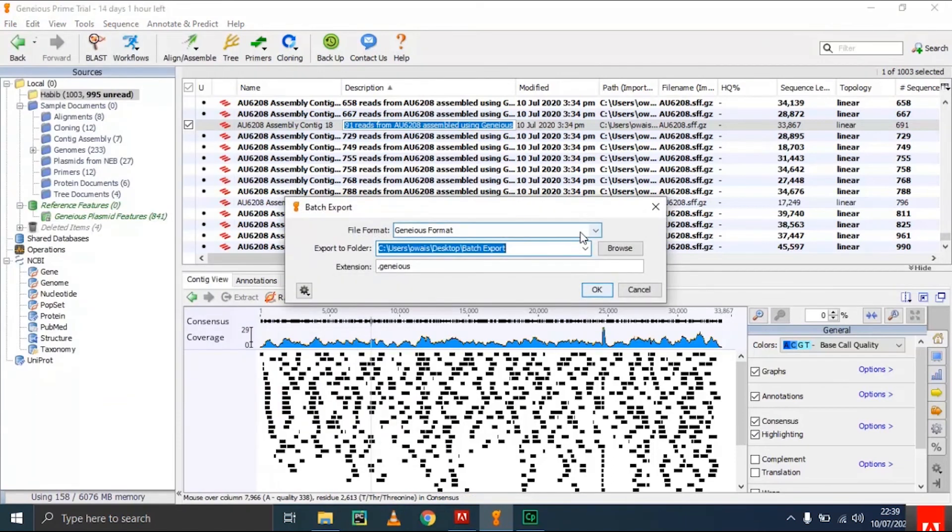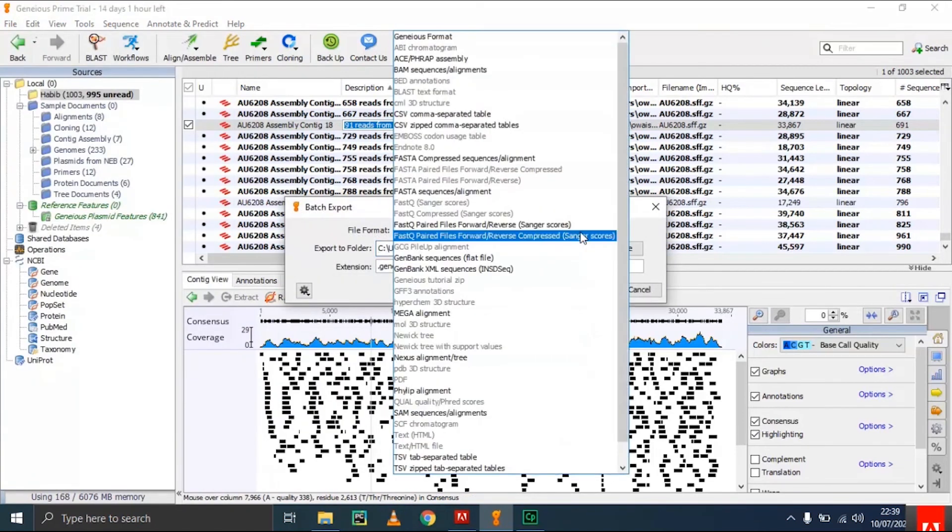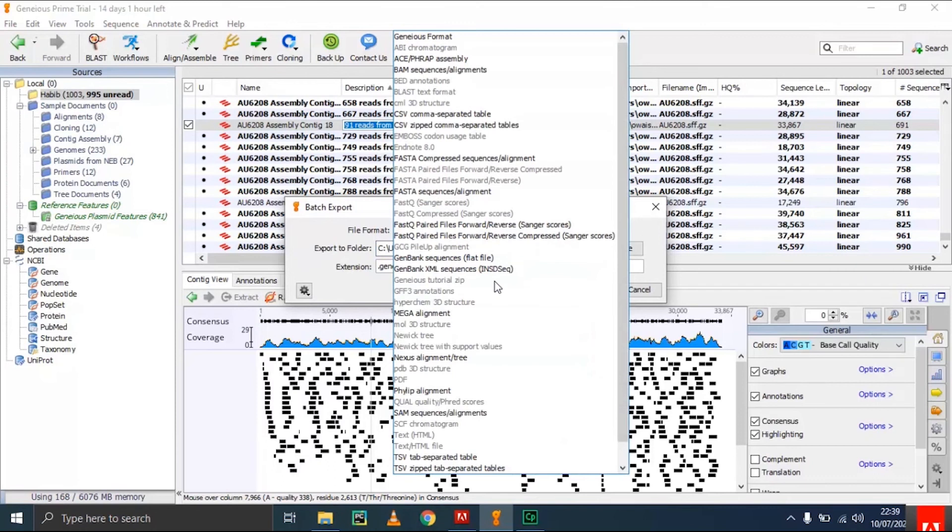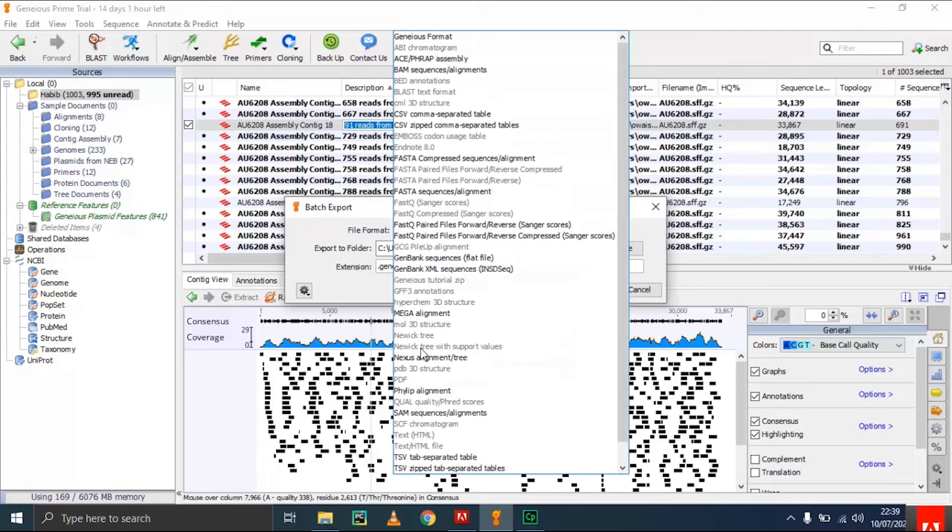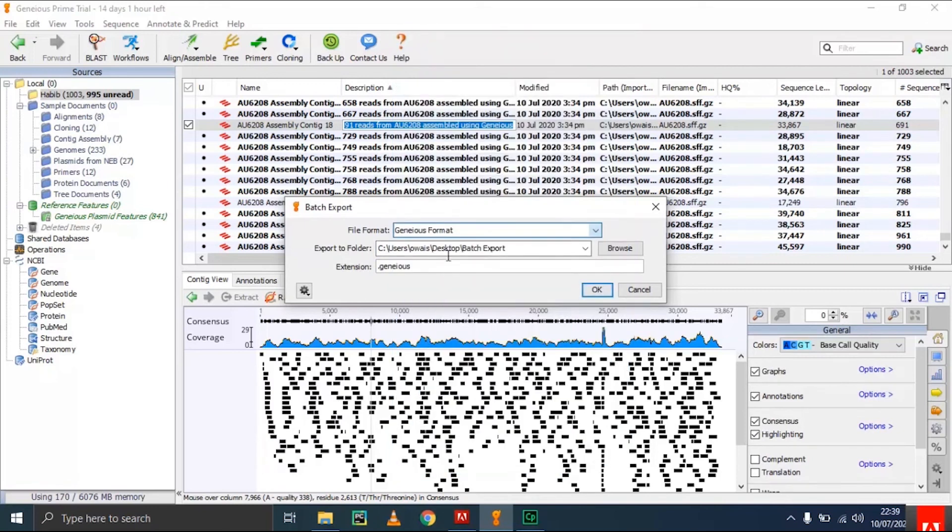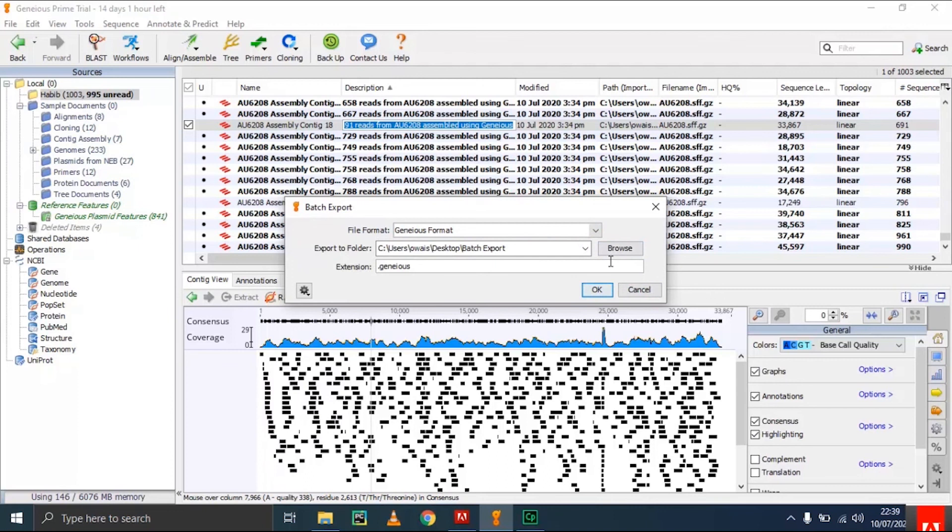This is the file format of Geneious, and you can see a variety of formats are available: text format, MEGA alignment format, FASTA format, and the Geneious extension. You have to browse for the location.